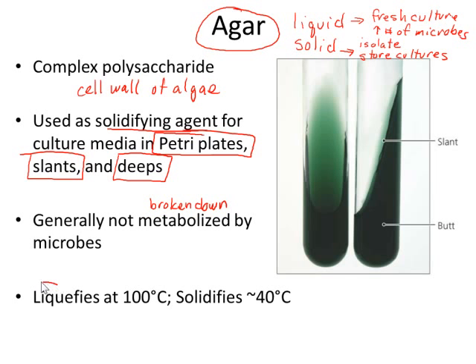Now, when we sterilize the media, it's going to be in a liquid state. So when you raise the temperature to 100 degrees Celsius, then as it cools to room temperature, it reaches that 40-degree threshold in which it solidifies.